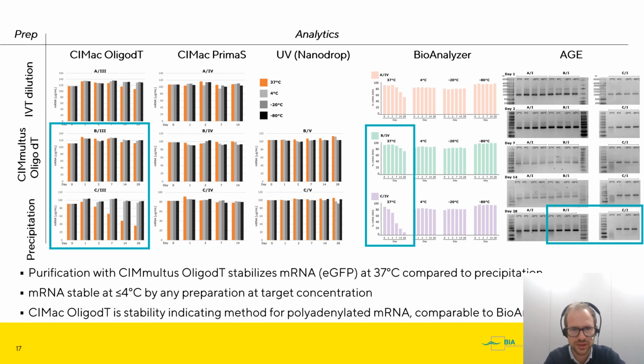What we also demonstrated was that affinity analytical chromatography can be a good indicator of stability, whereas alternative methods, for example UV, but also this anion exchange analytical chromatographic column, were not stability indicating in the same way.